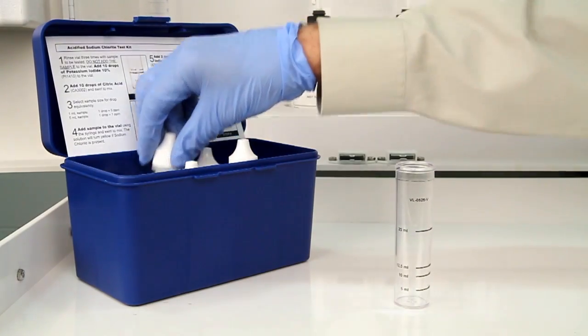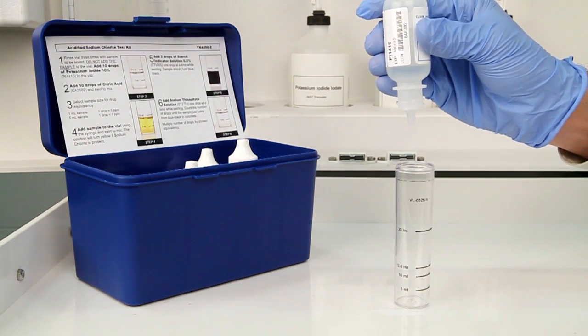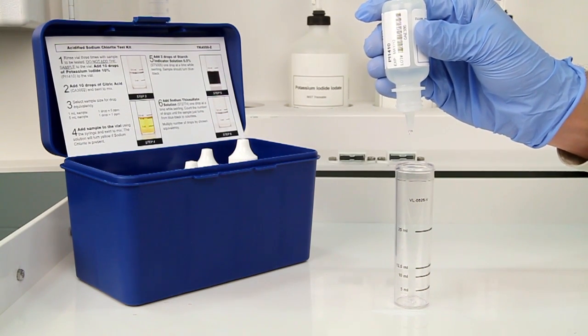Before adding your sample to the vial, add 10 drops of potassium iodide 10%. The bottle contains a dropper tip, so it's important to hold the bottle vertically to get a consistent drop size.